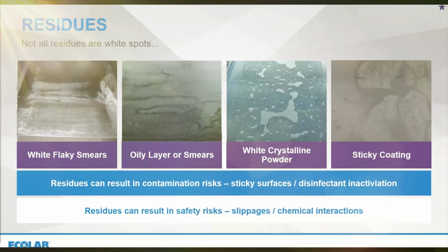And then also there are health and safety risks as well, because residues are going to make floors more slippery or more sticky, and we're going to have concerns around operators. So we've got these three areas of risk to product, risk of microbial adhesion, risk of disinfectant inactivation, plus the safety concerns as well, which all come together.